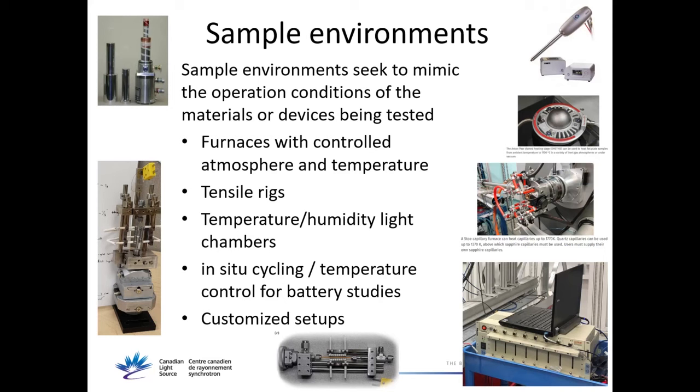For example, there was an industrial user that came to Joel and Adam, and Adam developed this cell here to study in-situ cement setting and watch the cement while it dries and what crystalline phases are there while it dries, which is important. Look around, that might be plastic, but cement is quite important. There's no need to reinforce that. So yes, there's a particular application. There's usually something we can think of, a solution and an environment to develop, to get more information about that particular system.